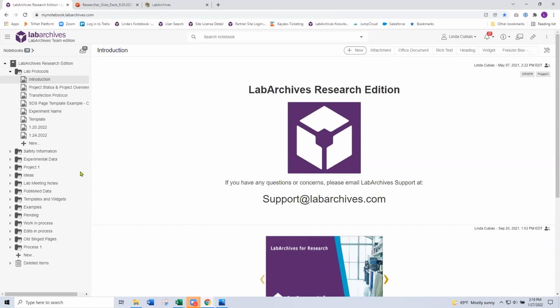When you first come in, you'll all default to what's called My Notebook. It's the first starting point you see. With My Notebook you can update, create, and add your own content, or create a new notebook if you don't want to use My Notebook. I'll show you how you can do that in a moment. But what I'll first start with is some navigation. We'll talk about the structure and the page layout, and then we'll go through some of the features that you see across the top.